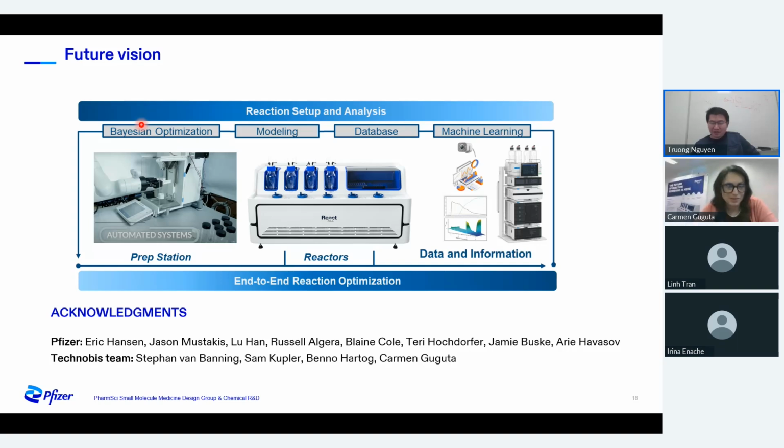Sorry, what was the question? If the reactor comes with product or impurity mass detection. We don't have mass detection. That analysis would be completely separate from the reactor. Yes, LCMS or so, right? Yes.